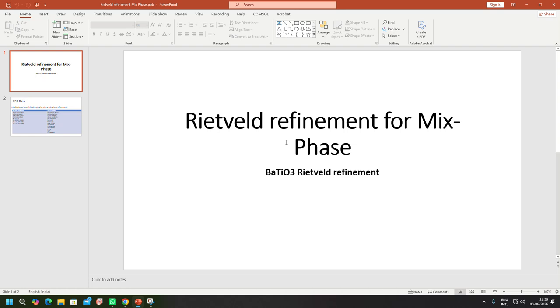multiple crystal phases like cubic, tetragonal, orthorhombic, rhombohedral. So using this video you can do your Rietveld refinement for mixed phase. So step by step, here I am showing you one example for barium titanate.